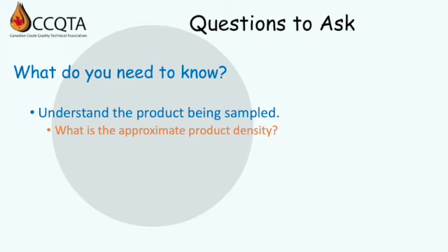However, keep in mind that diluted bitumen can have 15 to 30% of low density diluent as part of the overall composition. The density is a clue, but not the whole story. Next is, what is the approximate vapor pressure? The vapor pressure, if known, obviously, is the best indicator of the volatility and how the sample will behave during sampling, handling, and testing.